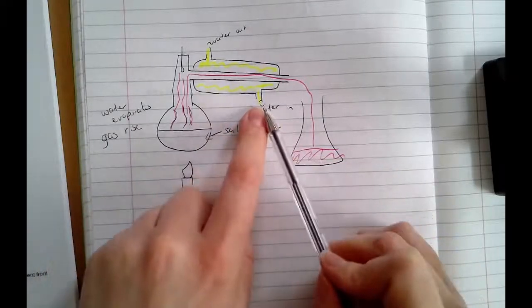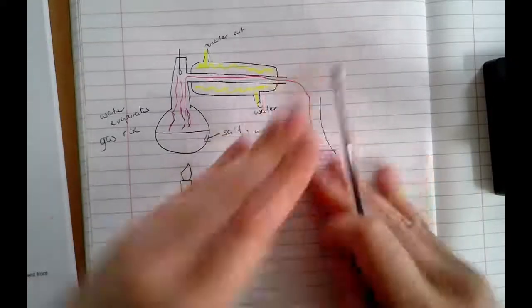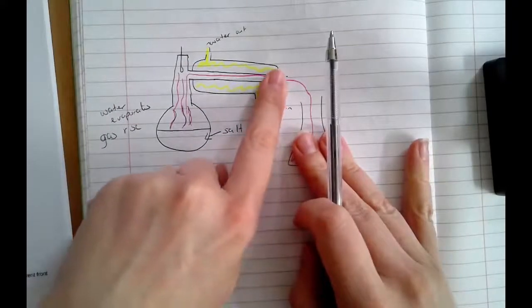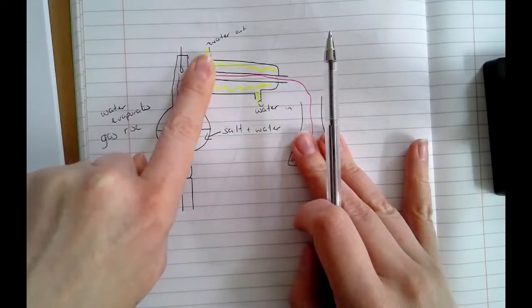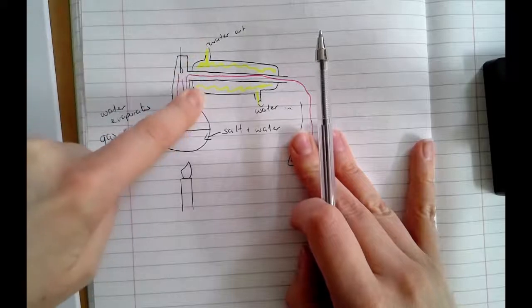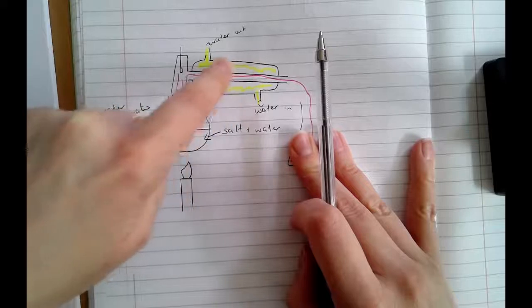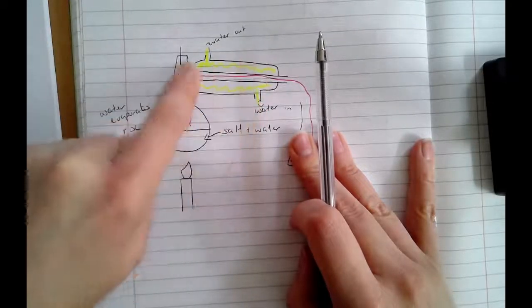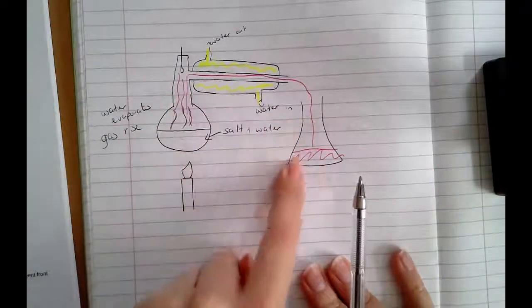And the reason is that if you put the water in at the bottom, it has to go against gravity, and it fills slowly from the bottom, but it means that the whole condenser ends up full. If you put the water in at the top, it will just fall to the bottom of the condenser and flow out, and the top part of the condenser will remain empty. You need water on both sides of the condenser, so you always fill from the bottom, and then you collect your water here in your flask.